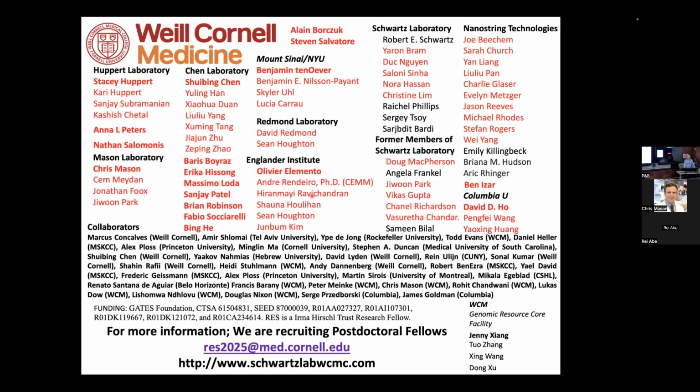And I don't think we have a good answer for that. I mean, all I can say is, and obviously Chris can jump in here as well, what we've seen is we need more. We have not run into a situation like, well, we could do with less. Yeah, more. There have been some papers that looked at this in bulk RNA-seq in the early 2010s, and there you can get to homogenization or saturation of signal because you've homogenized the tissue. But that requires, I think, hundreds of millions of reads.